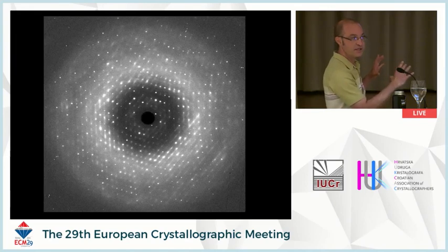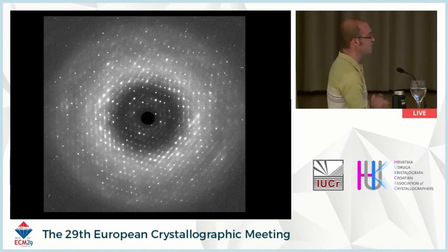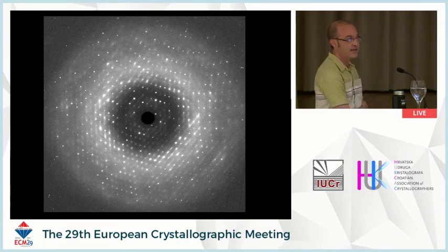This image is distorted on the slide in your view. It looks oval, but actually this is meant to be a square image. And so this is protein diffraction. It's diffraction from a calmodulin crystal. It has a background pattern that we're all familiar with. To some degree, in the background, we see this solvent ring, which is actually more or less equal parts protein and solvent in reality.